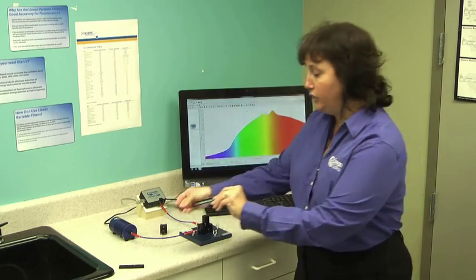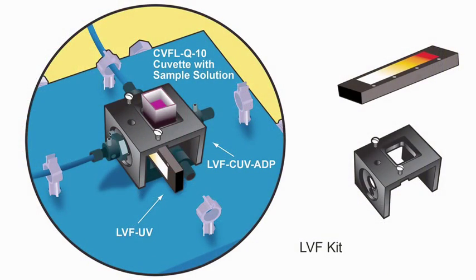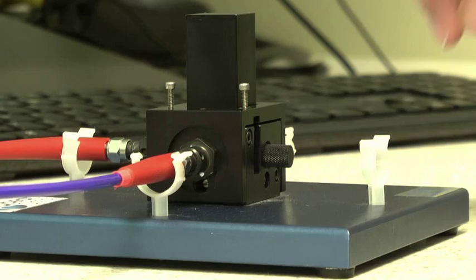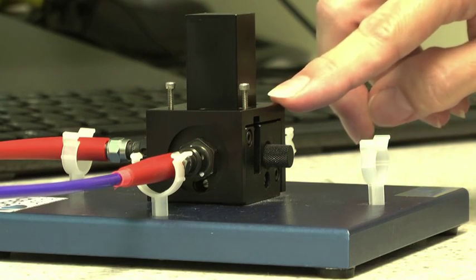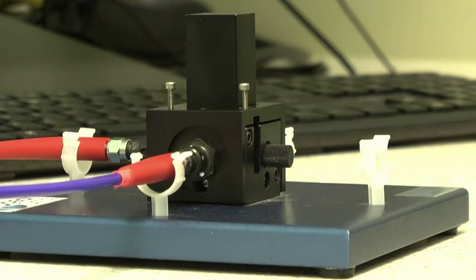So let's take a look at how we use these linear variable filters. In this case, I'll be using the linear variable band pass filter set with our four-way cuvette holder. I've already attached my LVF cuvette adapter to my cuvette holder, and now I'm going to slide my band pass filter into the filter slot that you see here.